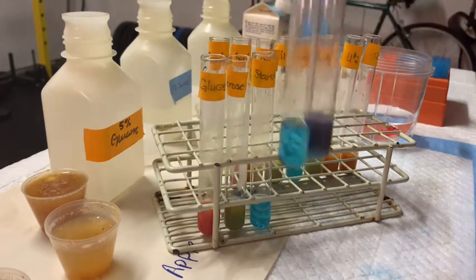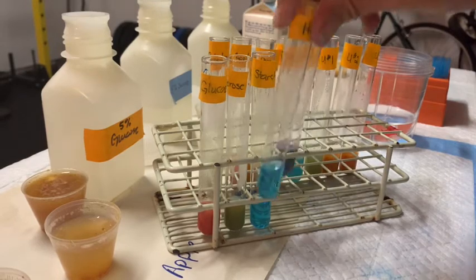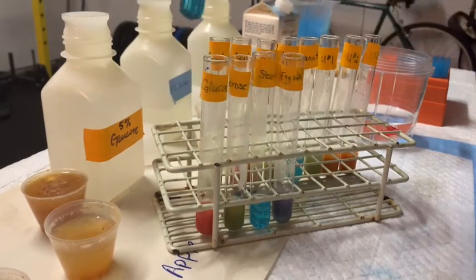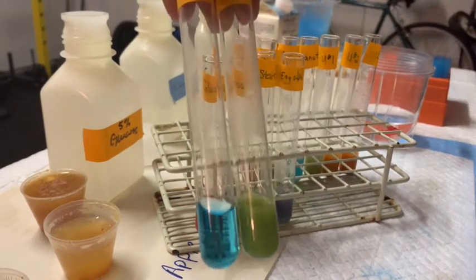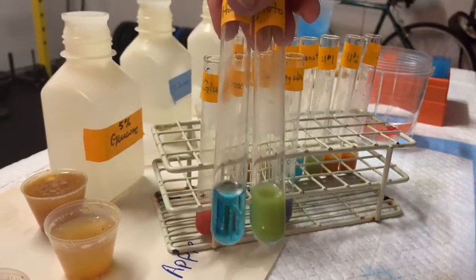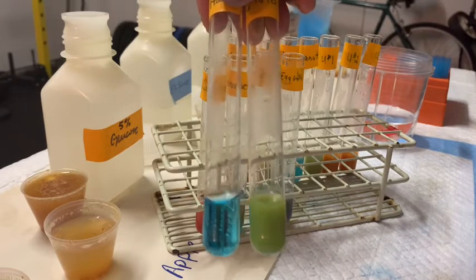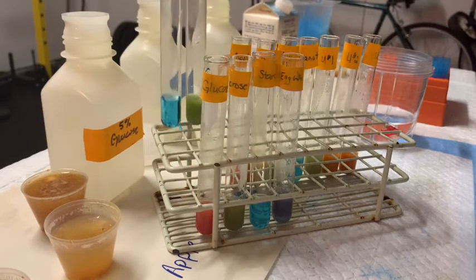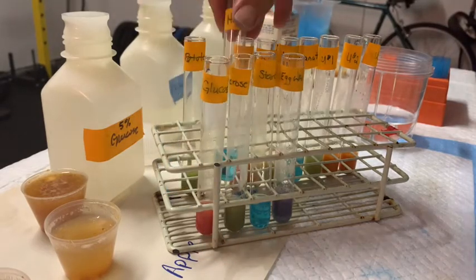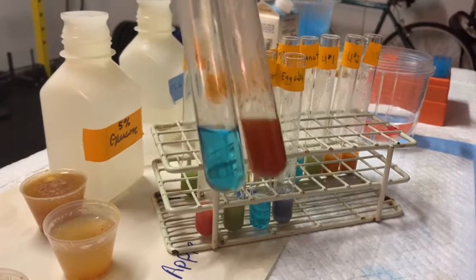Our egg white has a purpley color, so there might be some reducing sugars in the egg white itself. Now looking at our food groups — the potato shows a green color, which is indicative of a disaccharide that breaks up through the heat reaction into at least one reducing monosaccharide, meaning one of the two monomers of that disaccharide is a reducing sugar.